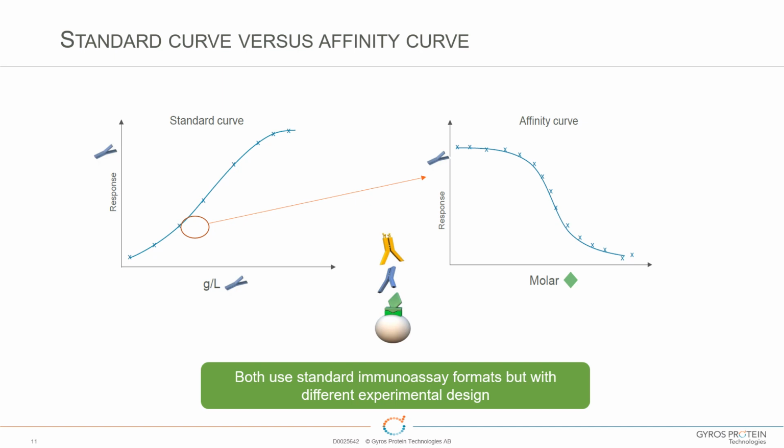And we will do another podcast series where we're going to focus a lot more on the experimental setup, when we go through how customers and people working on the system can actually design these affinity experiments. Yeah, I think that's important, to go beyond the theory and get into the practical aspects. We'll definitely tackle that in the next one, part two. Exactly. I think affinity conceptually can be quite complex for someone used to normal bioanalytical assays. But when we break it down, it's something that any scientist can achieve in their lab.